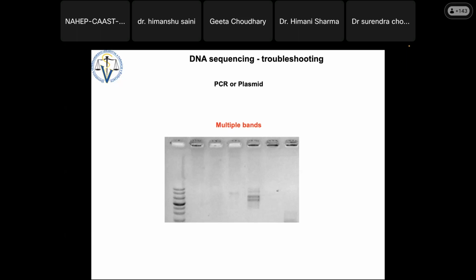So I will punch here, not here. I want to amplify this, so I will punch here, and then I will release whatever material came into the master mix. So don't worry about the agarose, don't worry about anything, and you will have an amazing result of a big prominent band, amplified of this band, not this, not this.